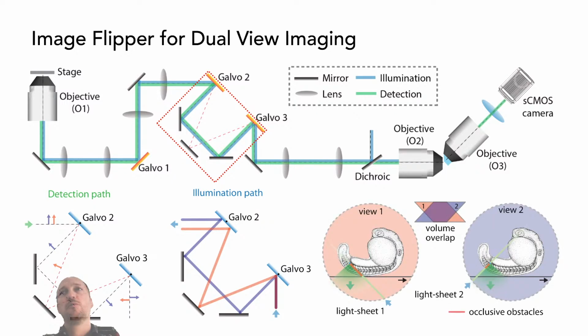And so basically, you get a situation where the two overlapping volumes that can be imaged are not perfectly overlapping, because of the geometry. The geometry is different, so there are parts that are only imaged in one or the other. But a large part, the majority of the volume, gets an overlap from both, and so as I explained before, we can acquire these two images and then combine the information of these two images into one image.